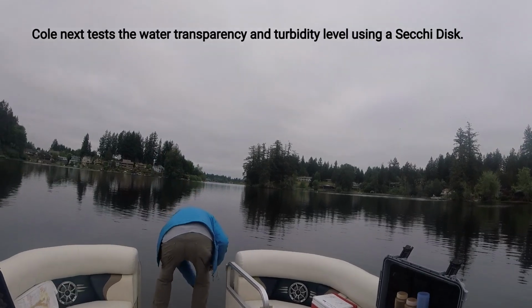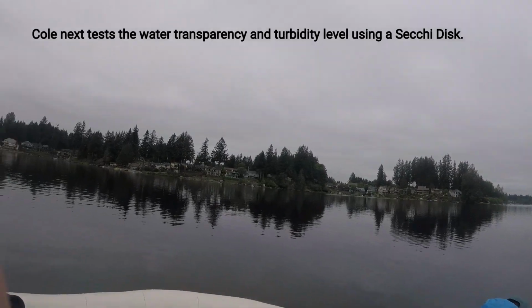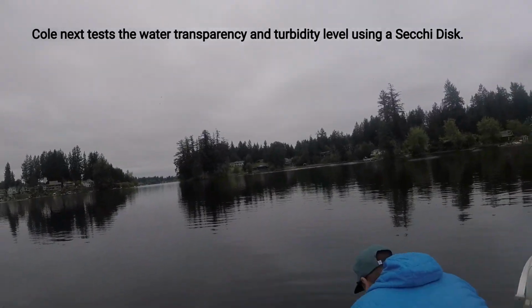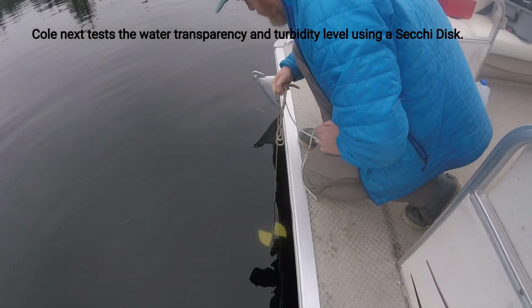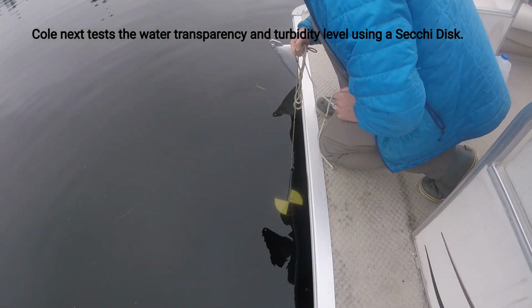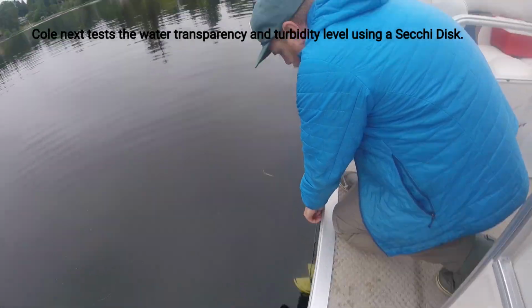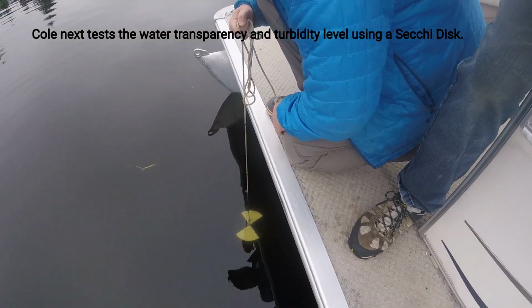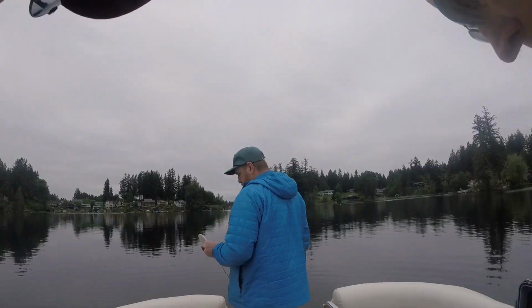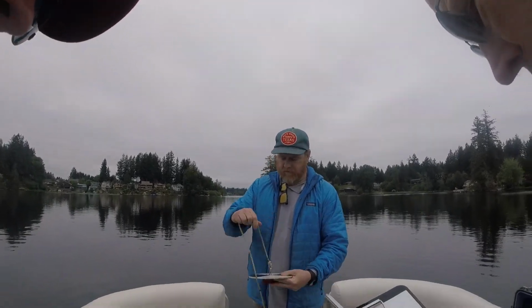So that's the Forel-Ule color wheel that was developed to determine the water color. There's so much algae in the water. Actually, it's pretty clear though. Or zooplankton. You can just see it all. Oh yeah, you can see the floating. It gives you the color on the color strip at a 6.